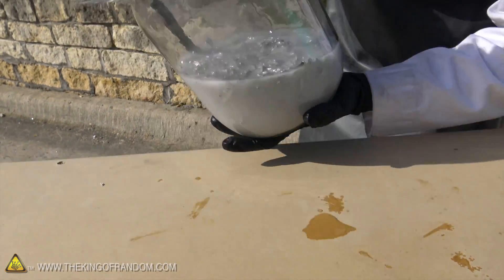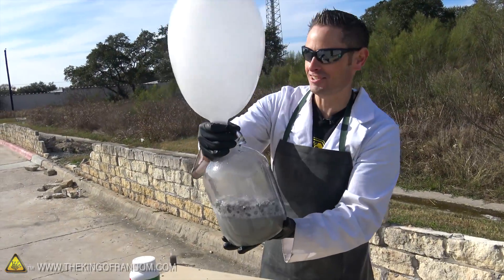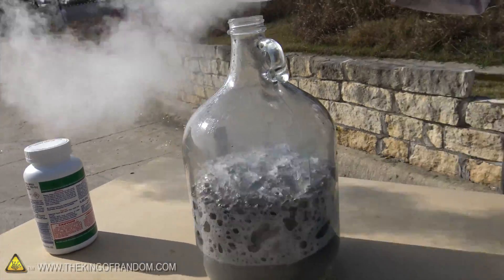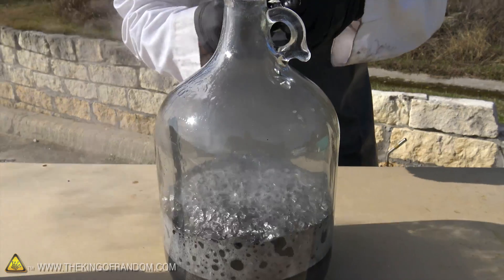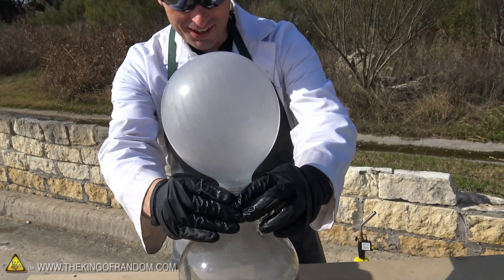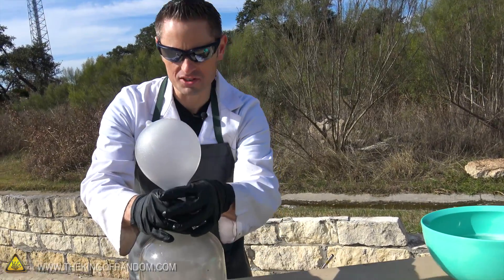We're definitely collecting some gas — you can see the balloon is filling up. We've already filled up one balloon and we still have quite a bit of gas coming. Oh my gosh, it's going crazy — it's actually getting really hot, the glass is getting hot. The balloon is filling up with really hot gas. This reaction is exothermic: it releases heat as it reacts with the aluminum, and you can definitely feel that. This glass is ridiculously warm right now.